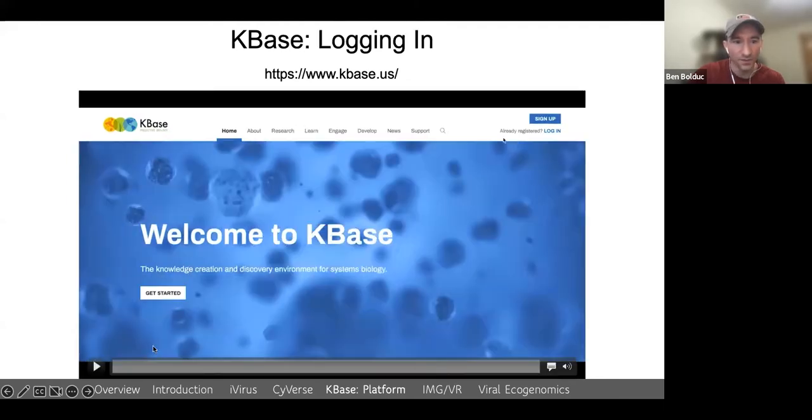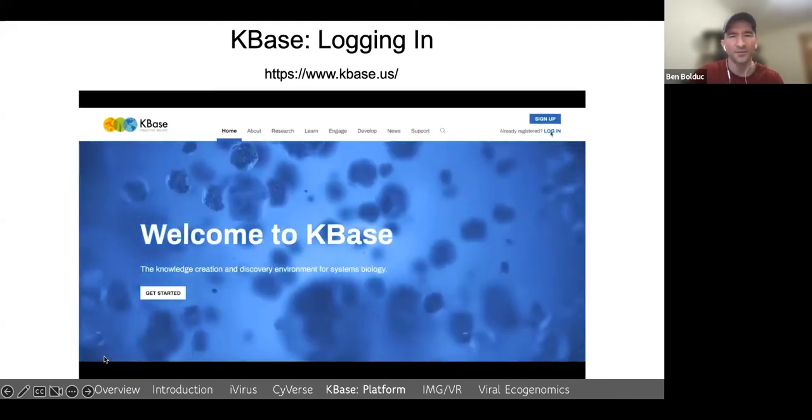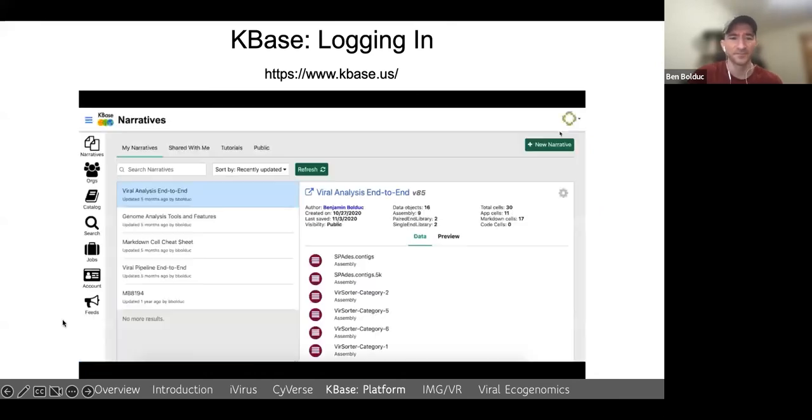Okay, so once you've logged in, what you have are narratives. And narratives are basically lab notebooks. I'll get to that in a second. You have various narratives. You can have those that are shared with you, your own narratives. They have tutorial narratives.